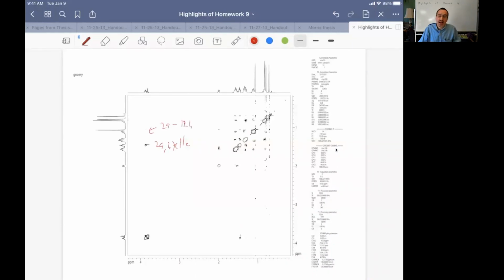One of the things that is bad is that we don't give you the spectra themselves, because it would just be too much work for you. But what would be really nice is if you could go a little bit deeper and say, wait a second, is this really a cross peak? I'm going to go a little bit deeper and see if it really is above the noise. We probably should have gone a shot deeper.